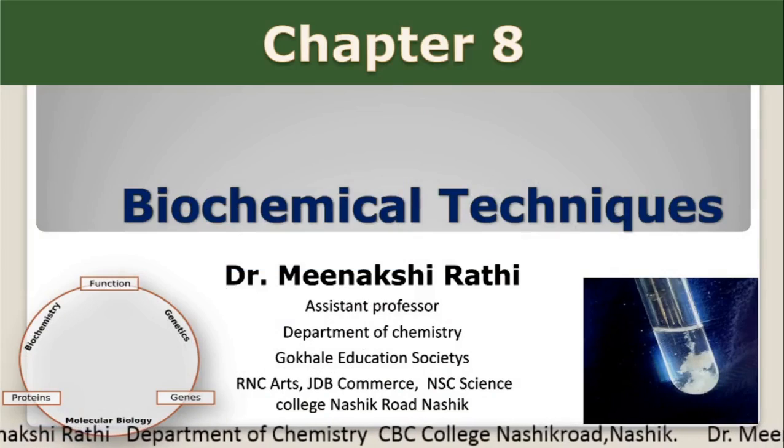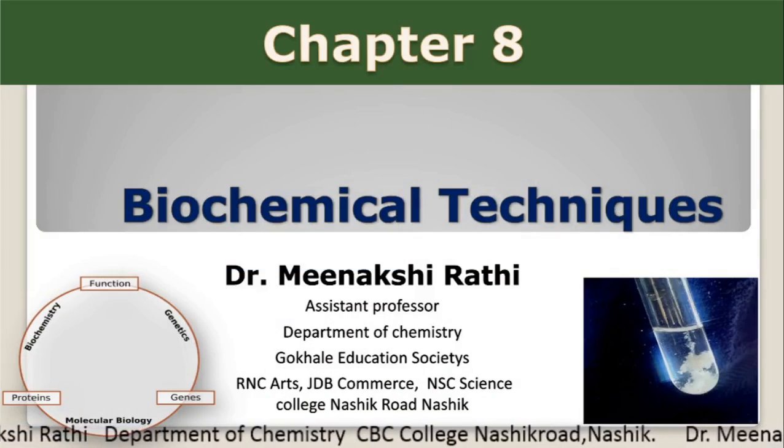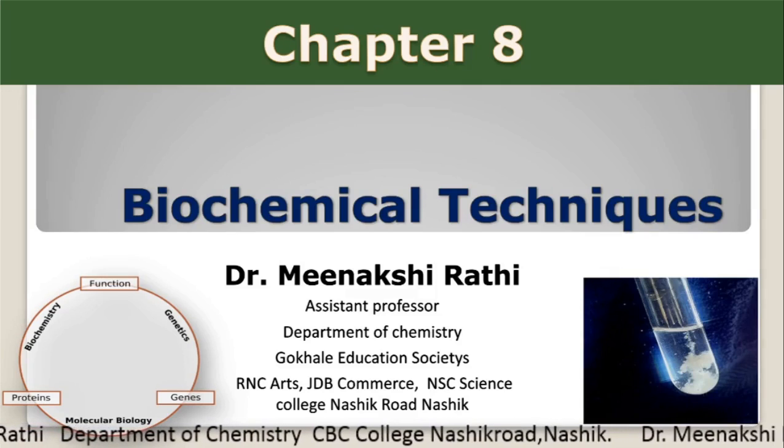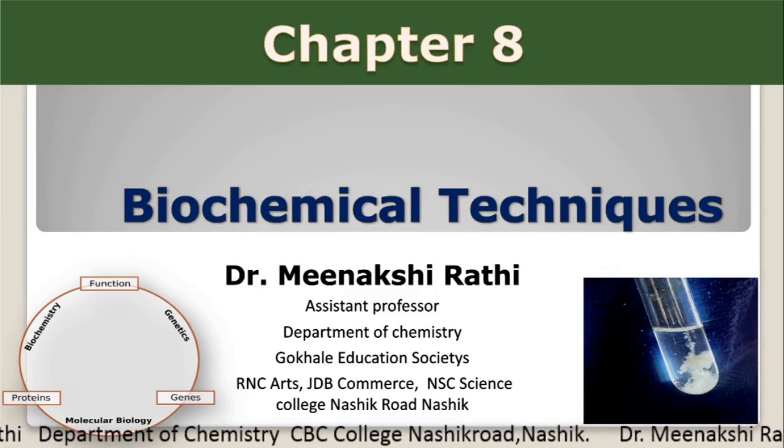Hello dear students. So now let's start with the last chapter of this semester, that is biochemical techniques.